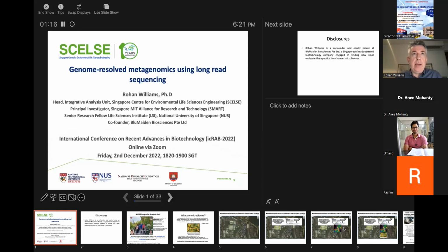So today I'm going to talk about what is called genome-resolved metagenomics. This is basically the contemporary way that metagenome data, or DNA sequencing data obtained on microbiomes and complex microbial communities, is analyzed.